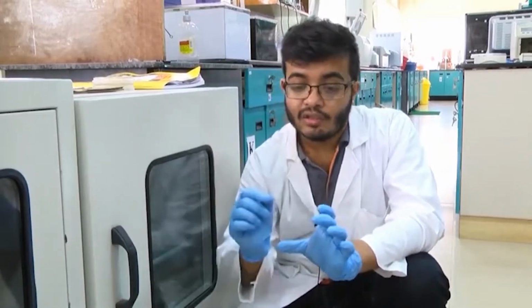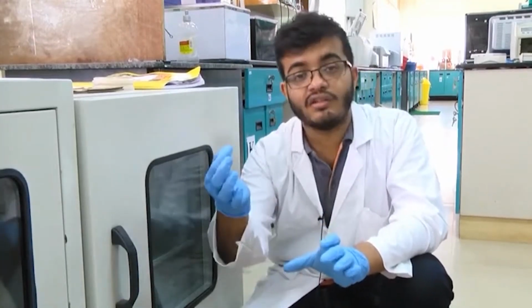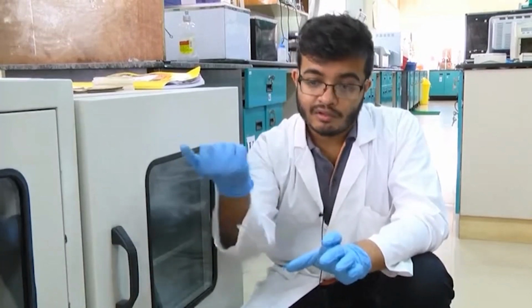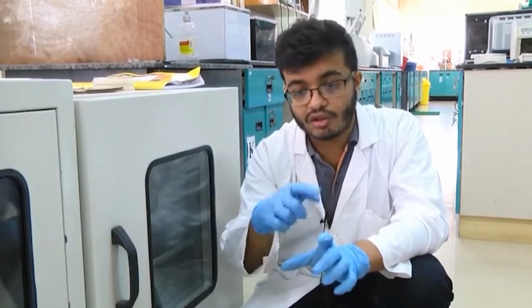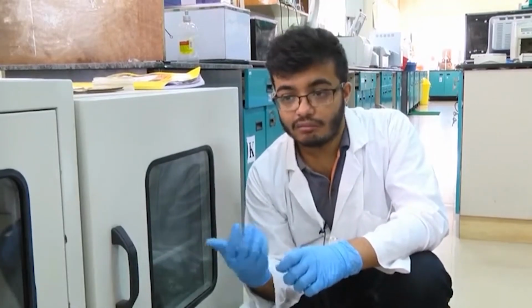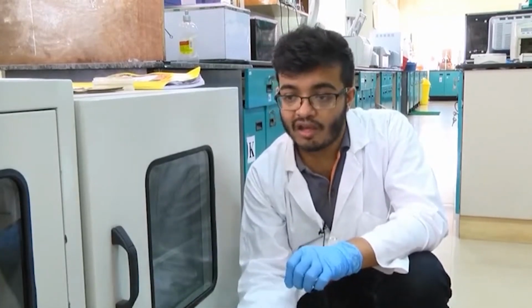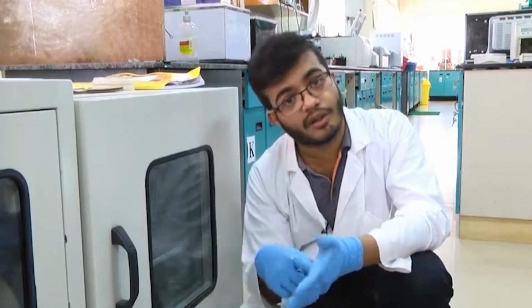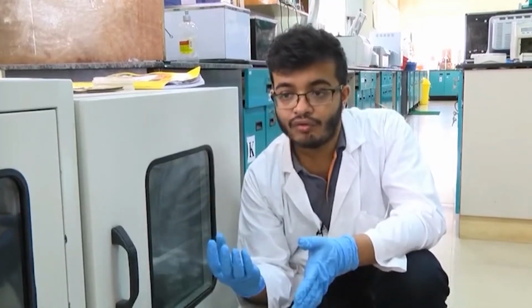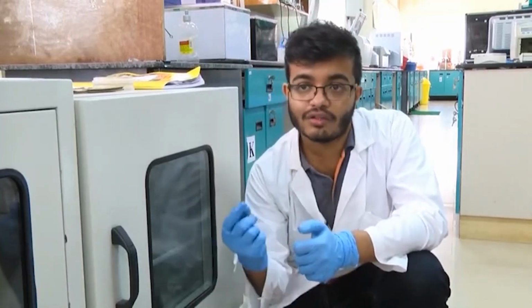Next, what are we going to do with these colonies? What you should do, since it is your experiment, is take one single colony, use a pipette tip, scrape off one single colony ensuring that you do not touch any other colonies, put it in a small amount of LB media, maybe 5 ml of LB media with the same antibiotic, and grow it overnight. So, now what you will have is a culture containing bacteria from that particular single colony. Once you grow it overnight, the next day you can isolate plasmid from it and also make a small cell stock.